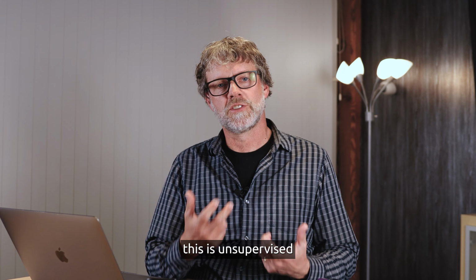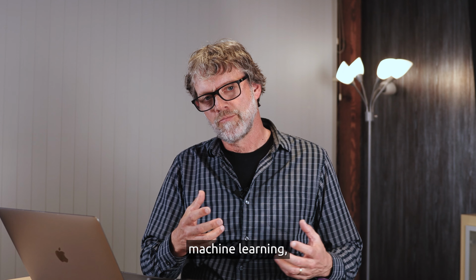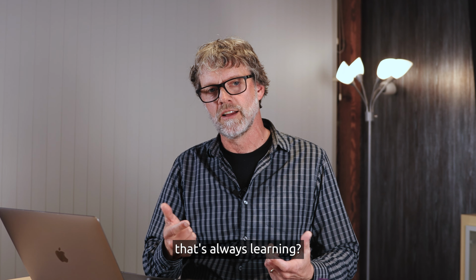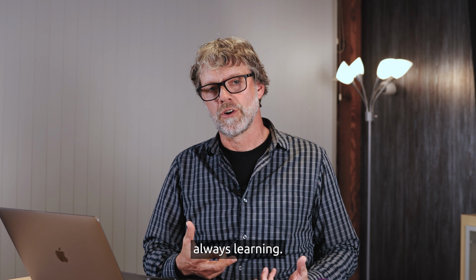They say, since this is unsupervised machine learning, does that mean it's always learning, and how do you qualify a recipe that's always learning? The recipe is not always learning.